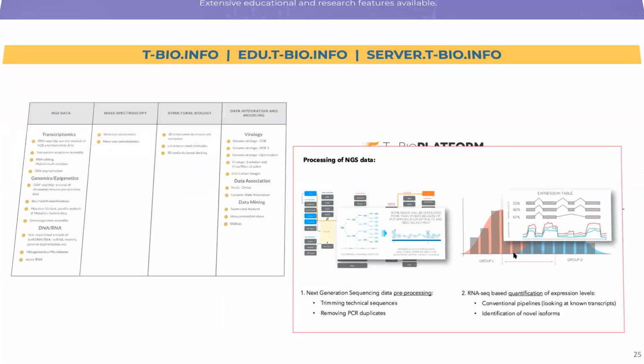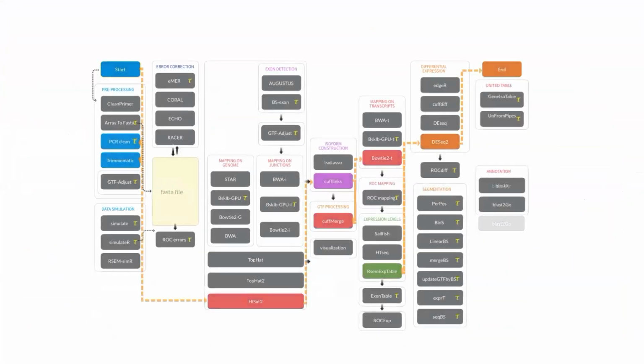As you go through this process, remember that this process is describing with color-coded maps the logic behind this analysis. For those of you who are thinking about the program, we are going to cover each one of these steps and describe how these steps form a logical approach to the analysis of next generation sequencing data. The colors help you remember what those steps are and how they are logically connected.